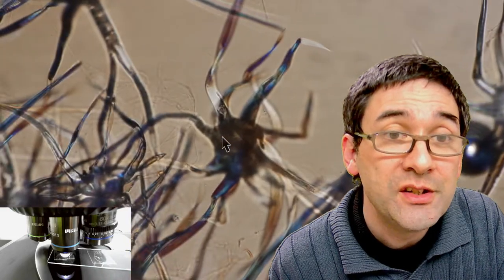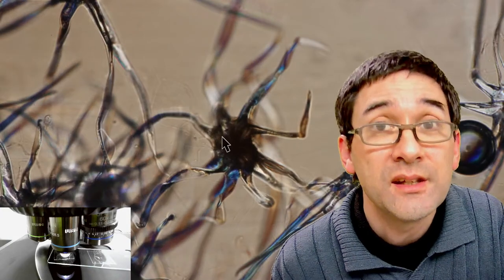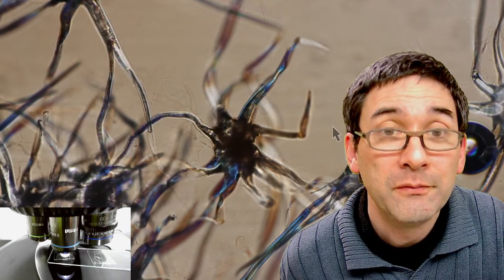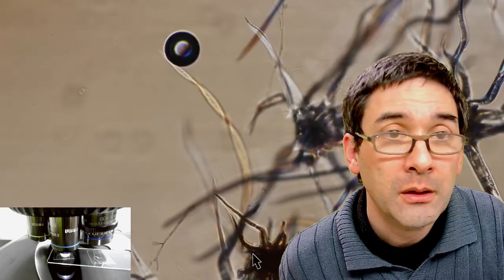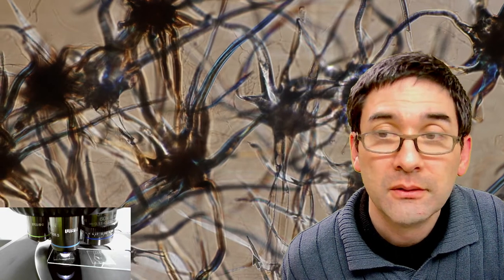I'll go up a little bit with the magnification again. There were several reasons why I wanted to show these to you: some people comment and find these things somewhere and say, what is this? Especially in dust, for example. I'm telling you these are trichomes from plants. A wide variety of different shapes are visible.